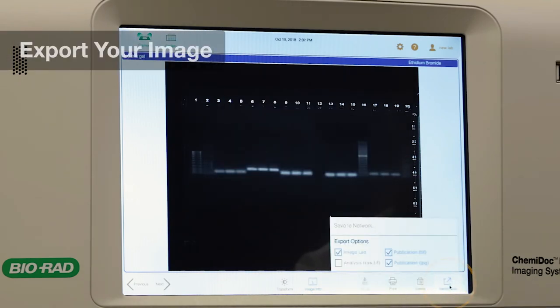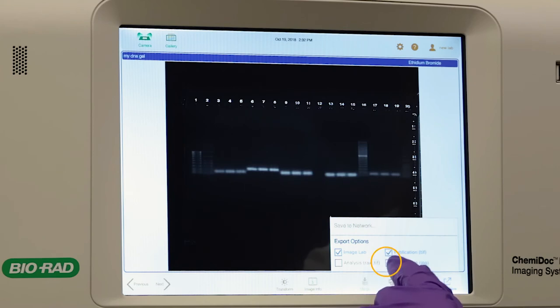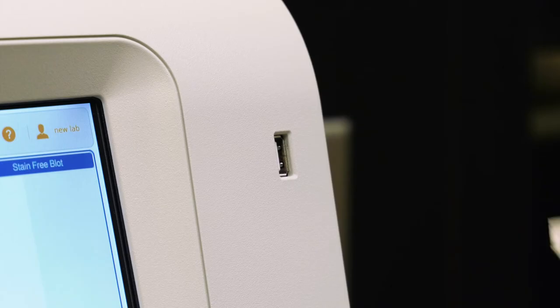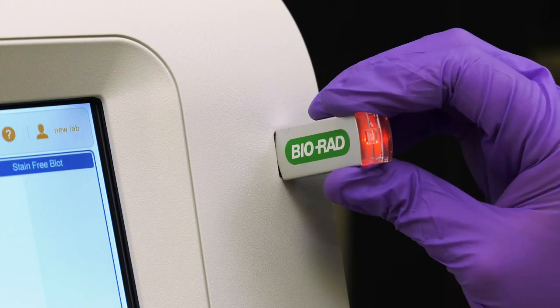Tap the Send Save icon to select the file format. You may export images in multiple file types. Under Export Options, tap a file type and the destination, either saving to a USB drive or to a network.